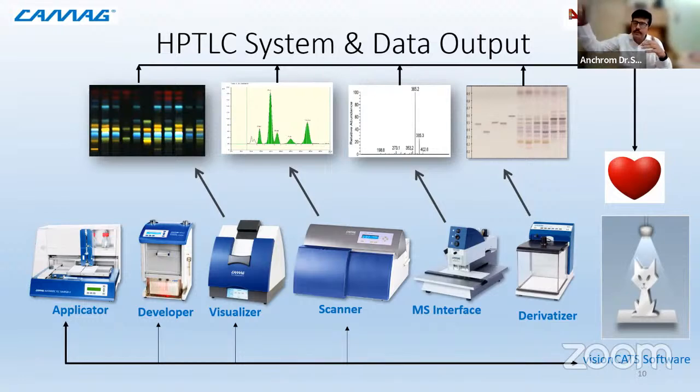You need to remove the plate, and it removes the plate from the chamber. And after that, it does this final job of drying the plate. So it is also taking care of drying your plate, where you can divert it to a fume hood, and the excess solvent is quickly dried off from the plate surface. That is how it does all these 4 things autonomously without any human intervention once the command is given.